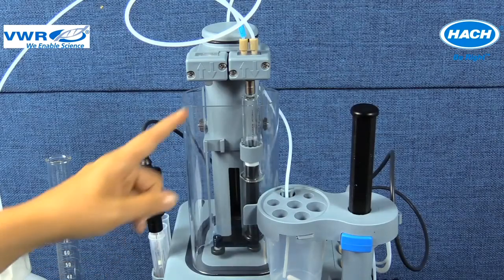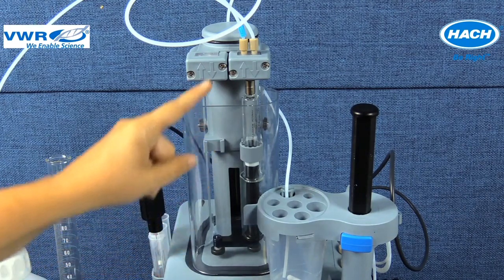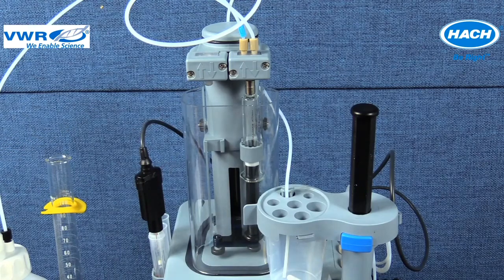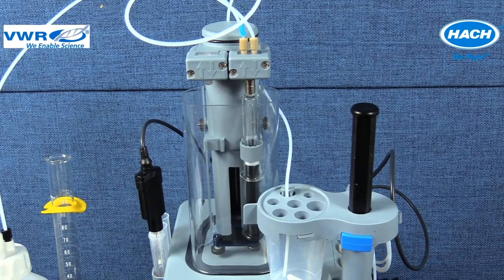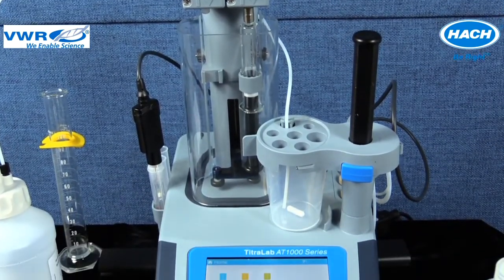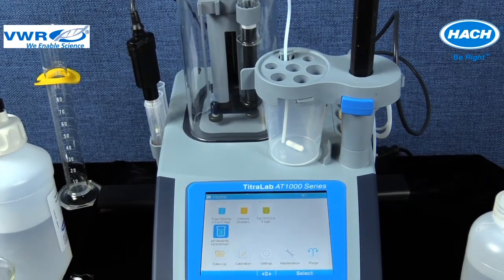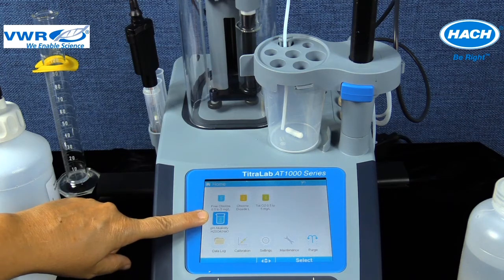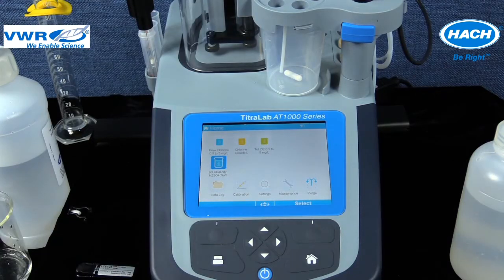A 10 mL syringe is installed in position 2 as detailed in the application notes, because of the location of this application in the second row of the home screen. The syringe setting in the Titrator software uses a 10 mL syringe volume as the default. The syringe size can be changed or confirmed in the software from the home menu by performing the following steps.